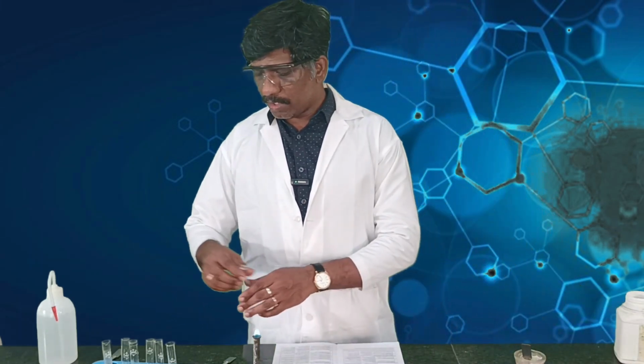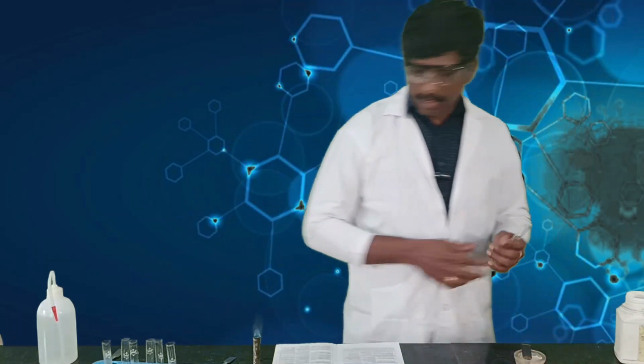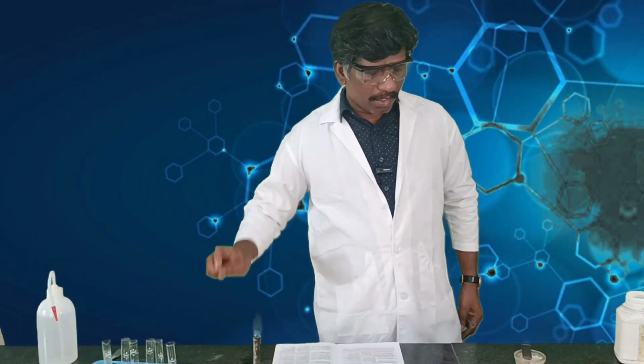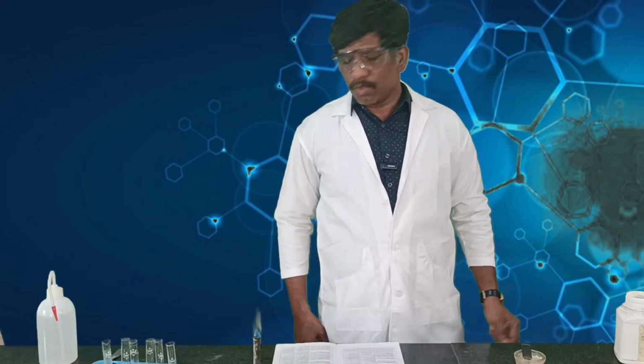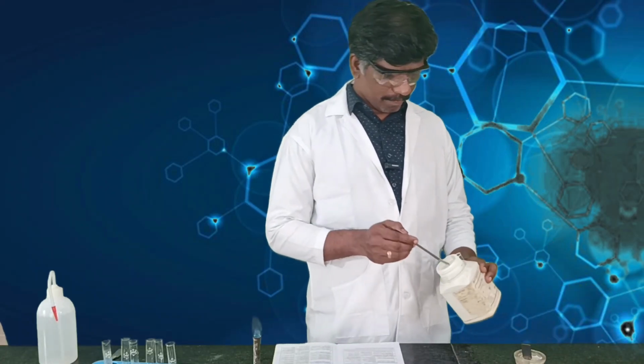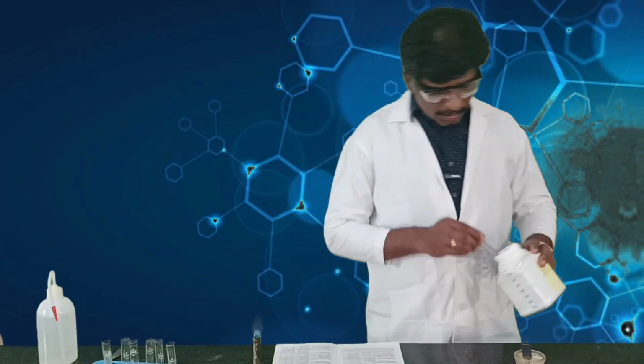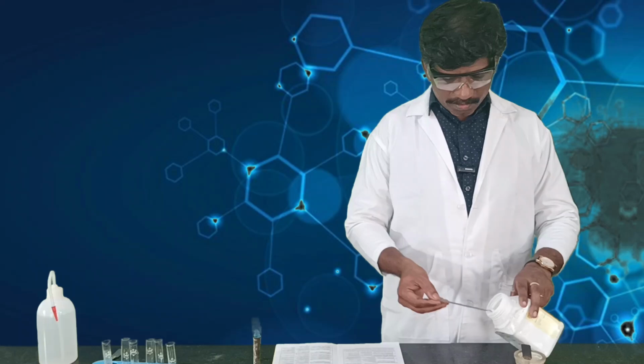Okay. Next, the presence of acid can also be tested using sodium hydroxide. The acid will be dissolved in sodium hydroxide, and when you add HCl, the dissolved acid will get regenerated. We can test that also. Take a little amount of your substance.